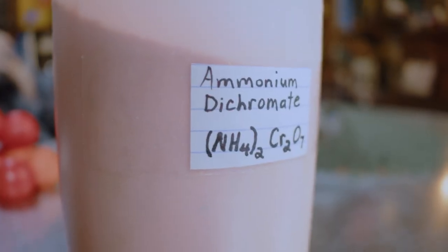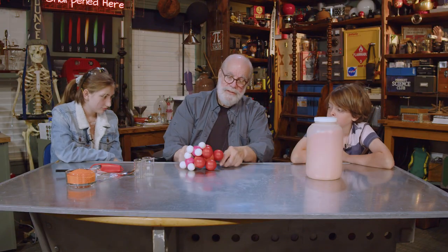That's ammonium dichromate. I made a model of it. So ammonium — NH4 — and there's two of them. That's the chromate, two Cr. See those two orange things in there?